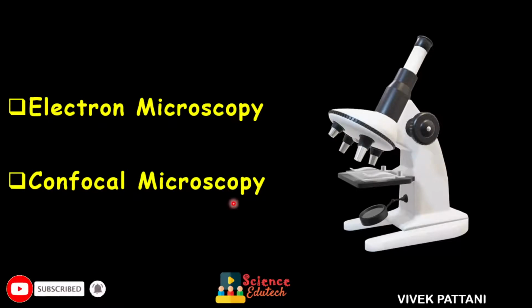There are several types of electron microscope, and each of these can provide different information about your sample. The field of electron microscopy is also expanding all the time, and there have been many advancements in the instrumentation.